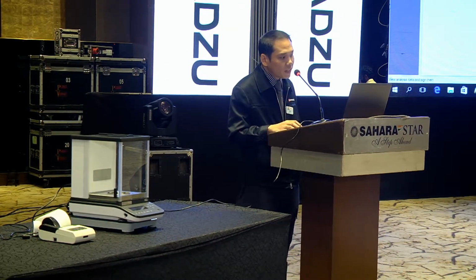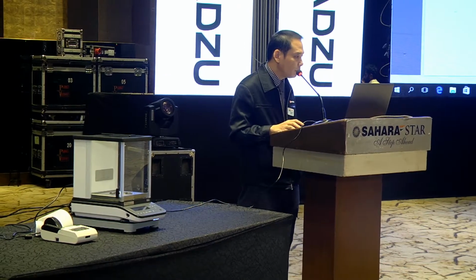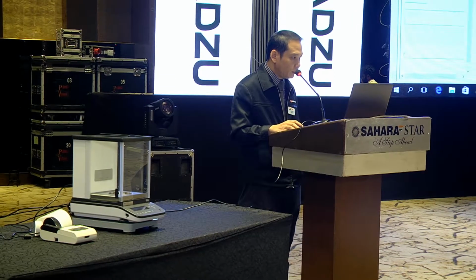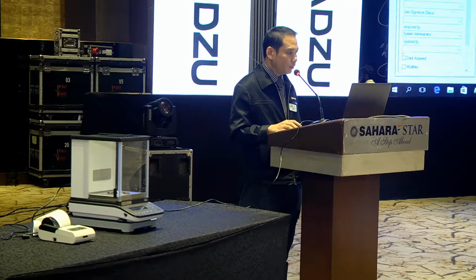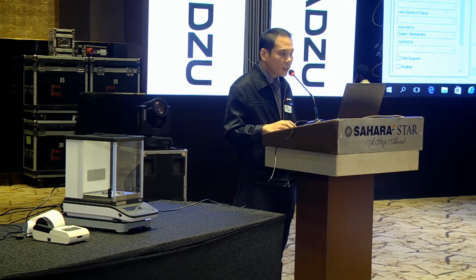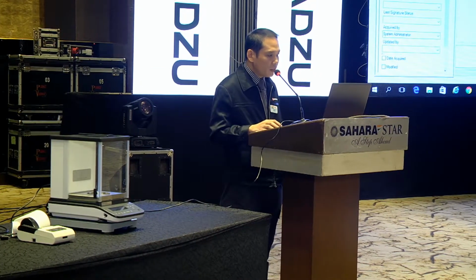So this is the data manager. You click. You select the project that you used just now, balance.